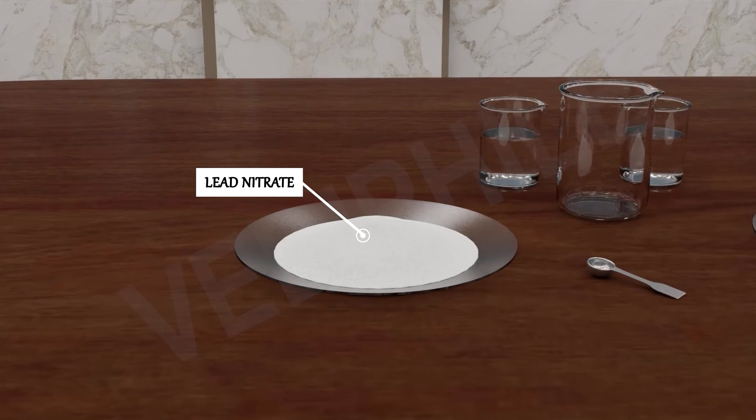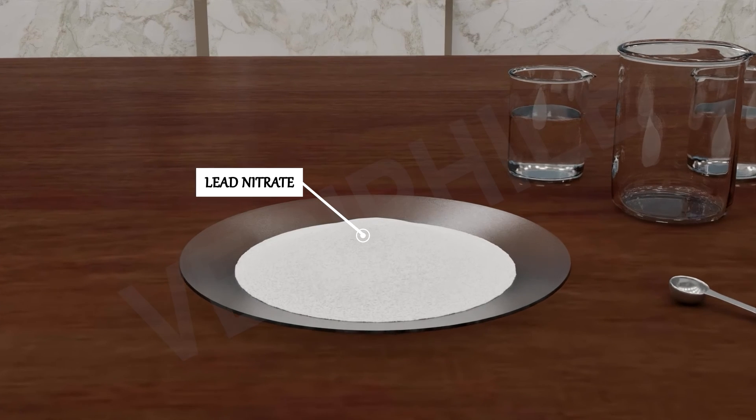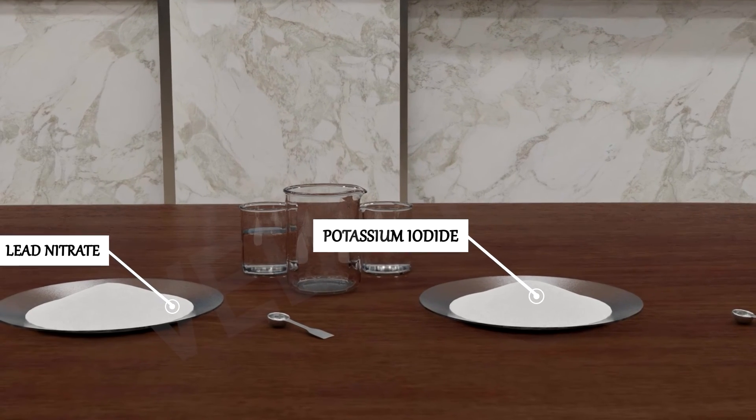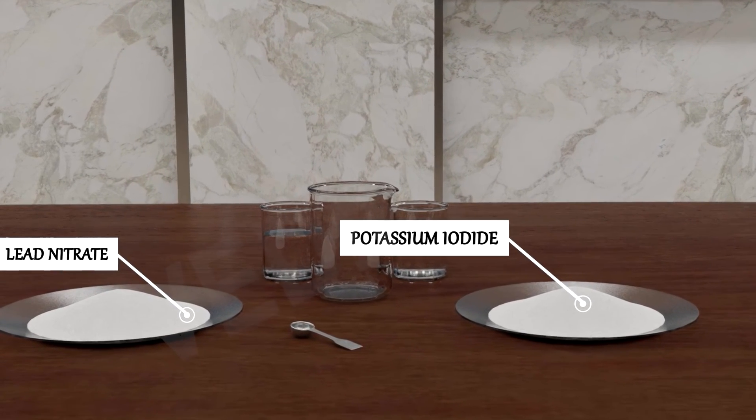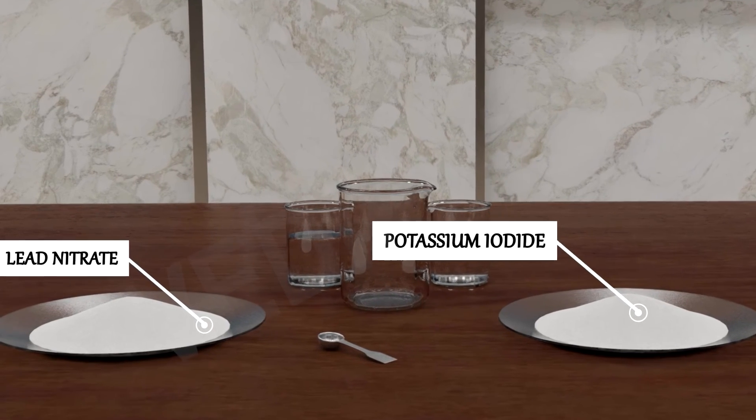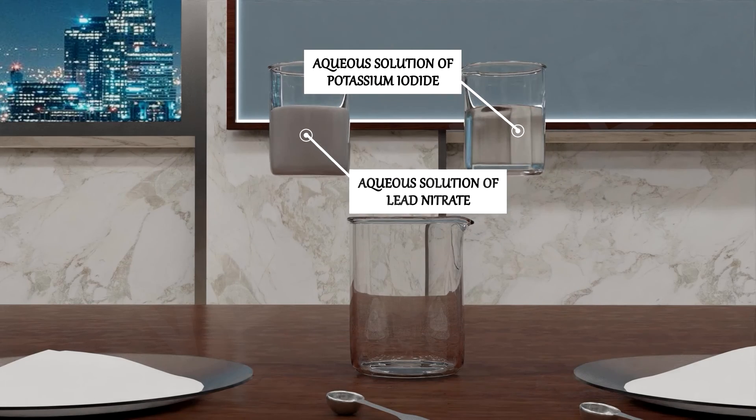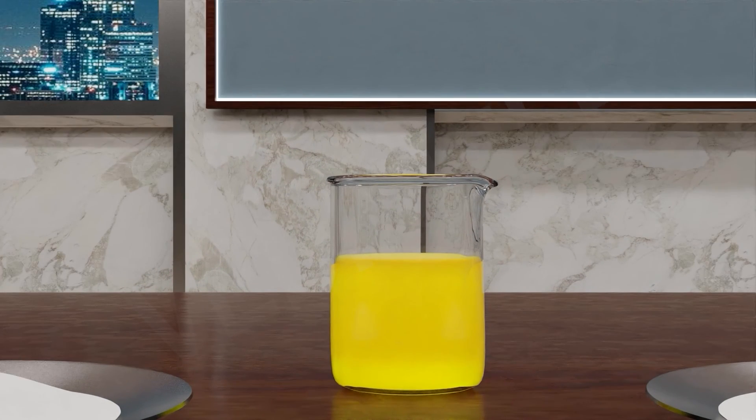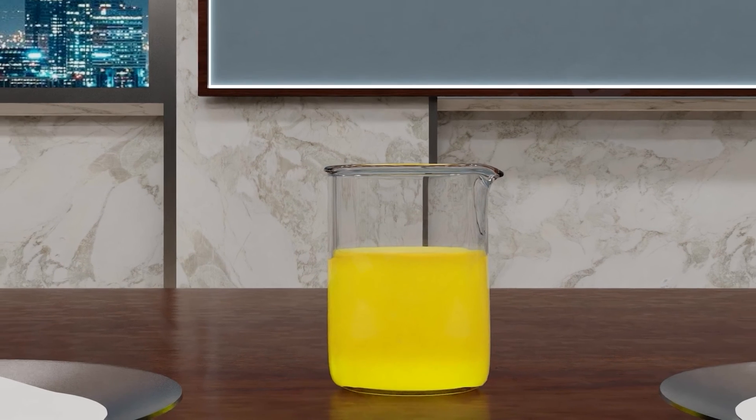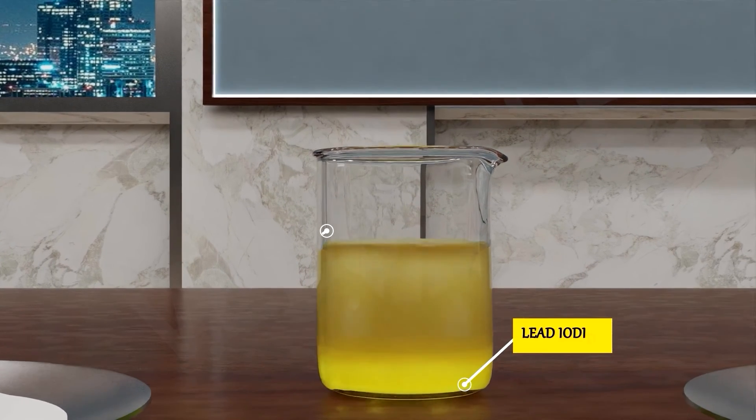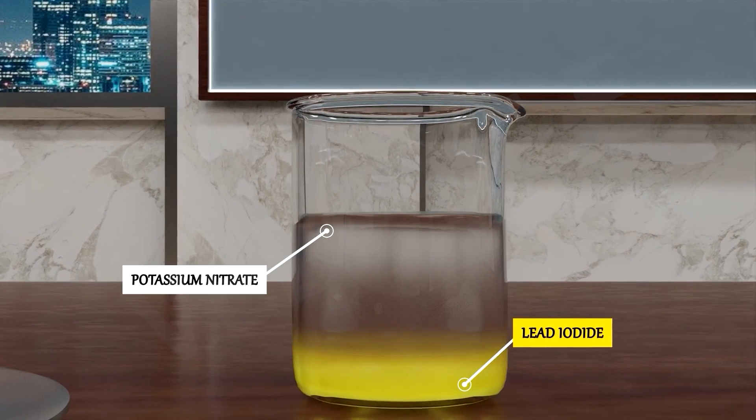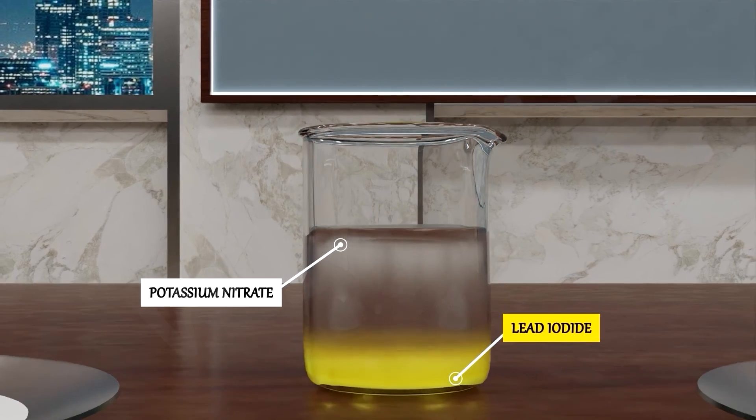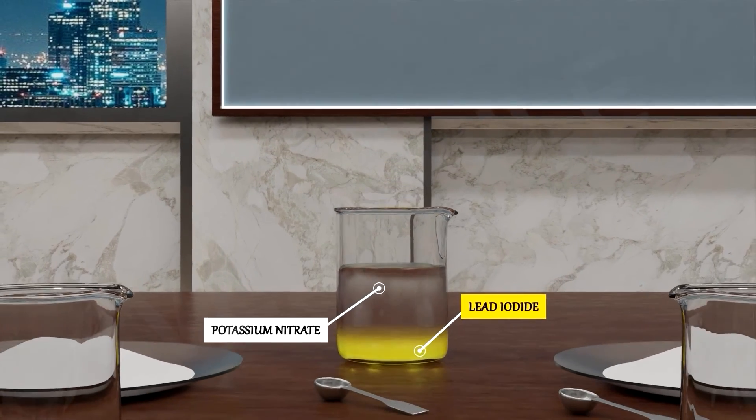So in this activity, we saw that lead nitrate and potassium iodide were both colorless. They reacted with each other to form a yellow precipitate of lead iodide. Lead iodide settles down at the bottom of the tube.